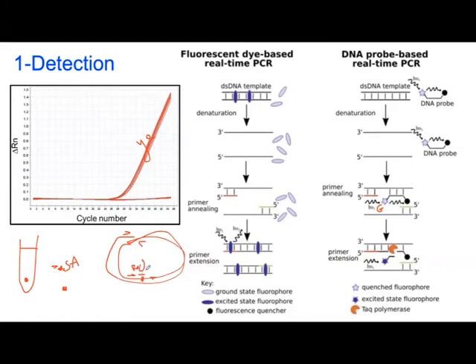And then I can multiplex them. I can put the 4 primers with the 2 probes in the same tube. And then my machine is going to tell me, remember that the Staph aureus is green. If I see green color, yes, there is a Staph aureus. But if I see green and red together, it will give me the 2 answers together. It says that there is a Staph aureus, and also this Staph aureus is resistant to that antibiotic.